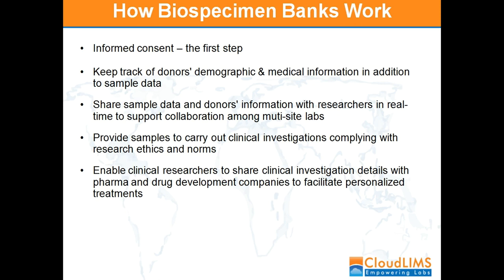And the second thing is that the biosamples stored in the biobanks are de-identified with a unique identification number, so researchers cannot identify the patients. So this is also the ethical point of de-identifying the patient according to the HIPAA rules.